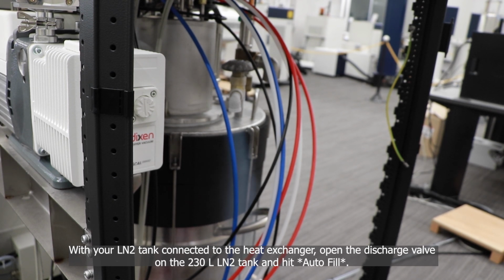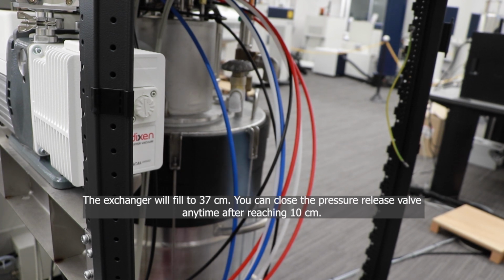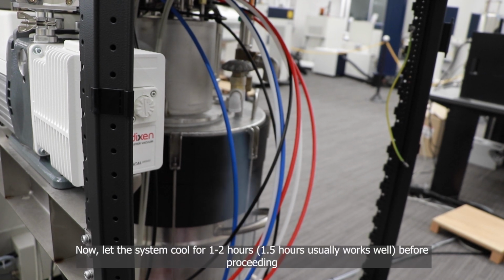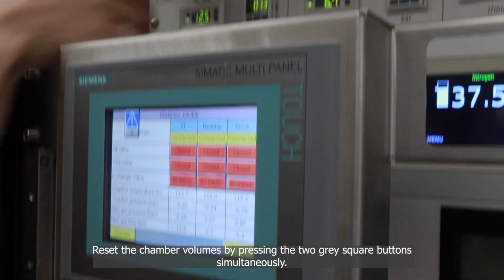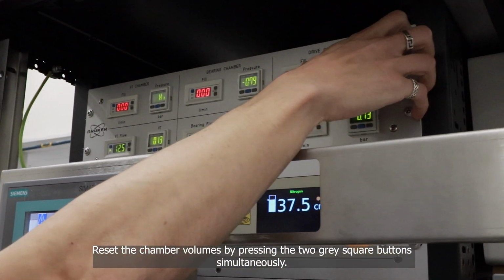The heat exchanger will fill to 37 centimeters, and you can close the pressure release valve anytime after reaching 10 centimeters. Now let the system cool for 1 to 2 hours. Reset the chamber volumes by pressing the 2 gray square buttons simultaneously.